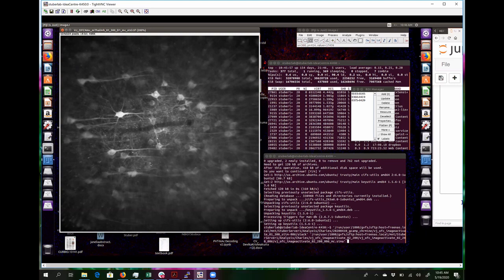And in general, and this is something that other people probably need to know, claims like 30% of the cells are active to this stimulus, 20% are suppressed by the stimulus, those sorts of claims are going to be super sensitive to some methods of your post-processing. If you say 30% of the cells are active, I would say it's probably anywhere between 5% and 50%.